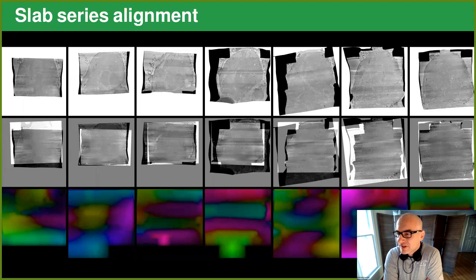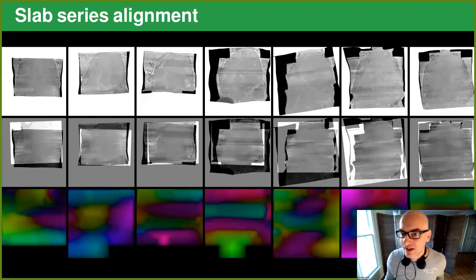And one of the issues that you have to solve there is what a good block size is. So if you have a large block size, you can see a lot of texture and you get a very reliable estimate, but it's overly smooth because you're averaging over the deformation within this field of view. And if you have a too small block size, you may not find the correct estimates because your texture window is poor and it's ambiguous where the correct solution is, right? So there's probably ways to do this smarter, but we didn't have one because we didn't have too many samples for this, because if you have 13 slabs, you have only 12 transition phases, and each of them is weird in its own way. So we engineered it a bit.